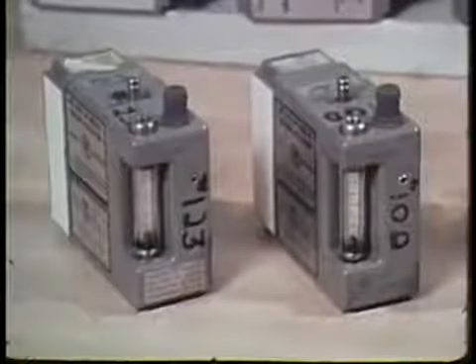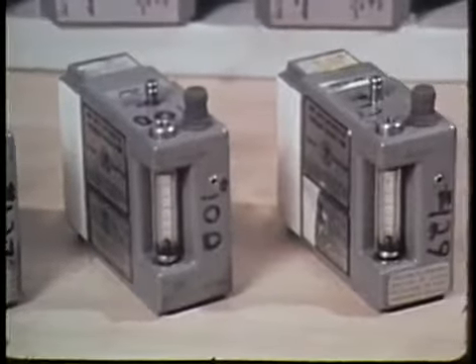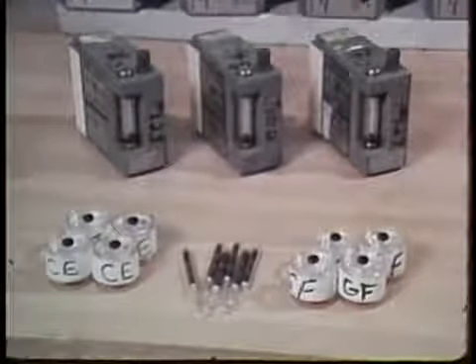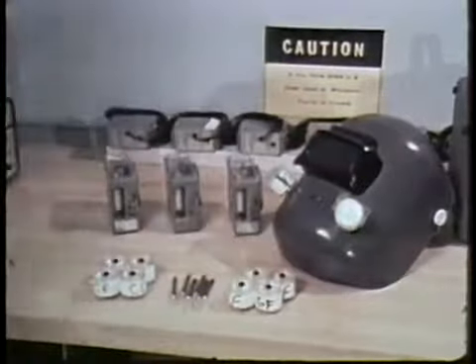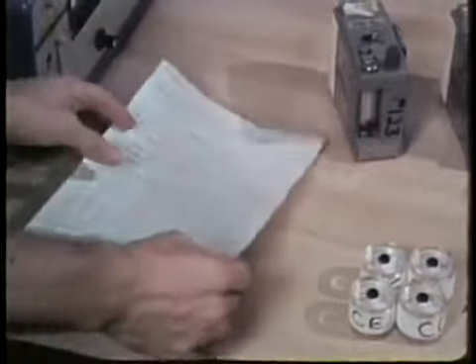You'll be using these personal air sampling pumps to sample for certain air contaminants at the motor pool. Along with them, you need the appropriate collection media for each kind of contaminant to be sampled. And for the motor pool welder, you'll also need the specially prepared welder's helmet. It's convenient to use copies of the air sampling data form for recording your readings during the survey.